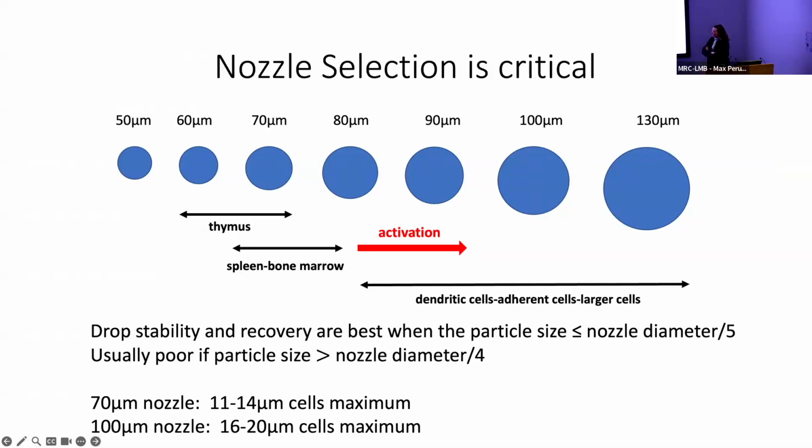We also have on our two Thermo Fisher Bigfoot sorters the ability to place in 120 and 150 micron nozzles for much larger cells and potentially more sensitive cells. So as the nozzle size increases, the pressure decreases. So they're sorted at much lower pressures.